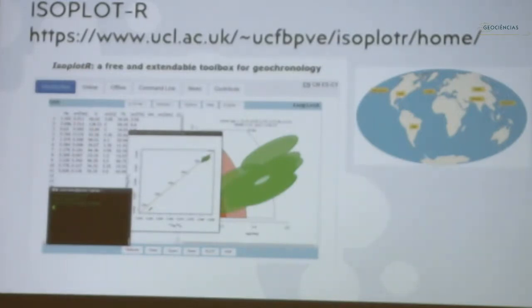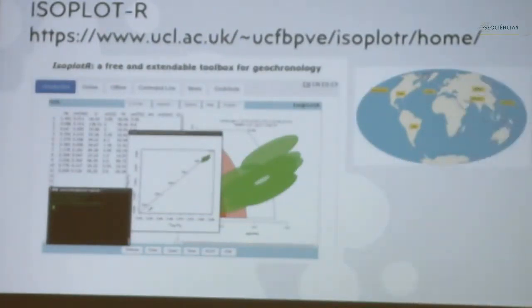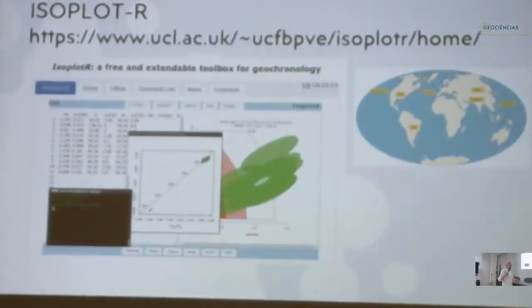There are several mirrors in different parts of the world, which is good. There's one in Austin, one in California, one in London, one in Europe, one in South America, one in India, and I think three in China. So you have mirrors in several places, and that's really good because it's very reliable: if one server is down, you can work on another. Sometimes you find that the version in London has more capabilities than the version in Austin or South America, because it takes some time for the systems to be updated. But other than that, they are pretty much identical.